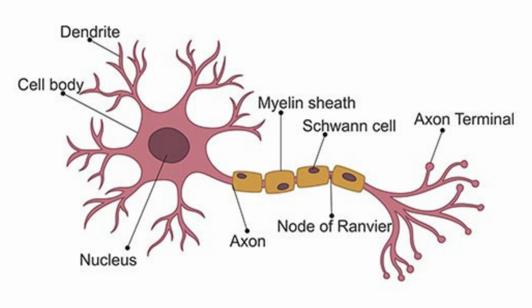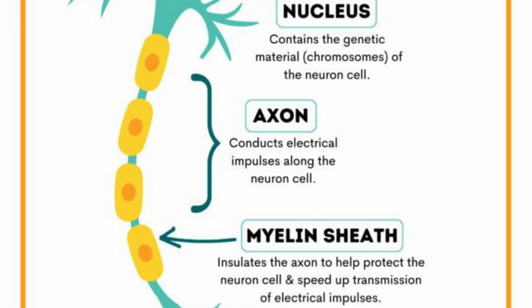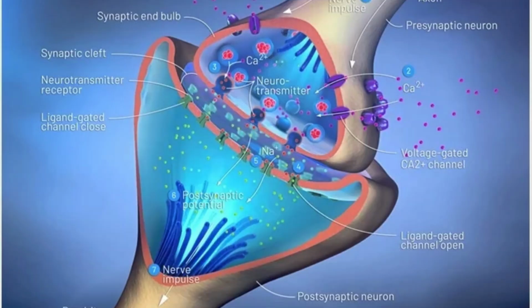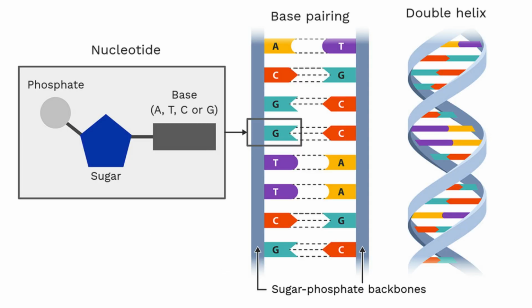A few of the most common ones are listed below. A, H and E stain, hematoxylin and eosin. H and E stain is the most used stain in histology and pathology labs. It produces a general impression of the tissue structure and is often used as routine examination. Hematoxylin. Hematoxylin is a basic dye which stains acidic cell parts, such as the nucleus housing DNA, blue or purple.